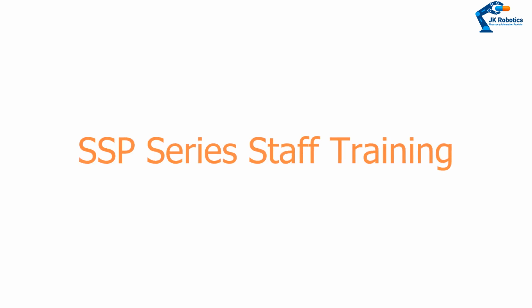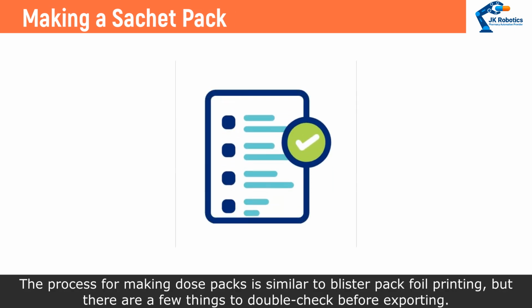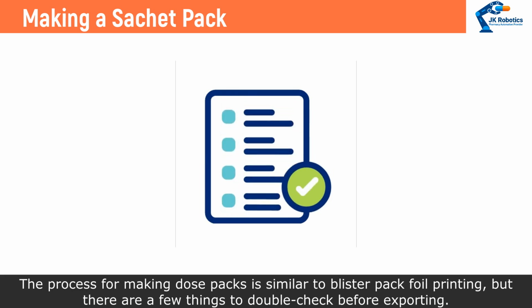SSP Series Staff Training. Making a sachet pack. The process for making dose packs is similar to blister pack foil printing, but there are a few things to double-check before exporting.